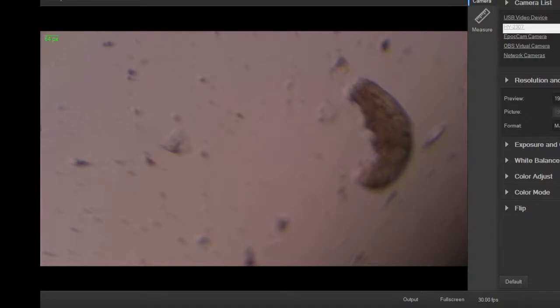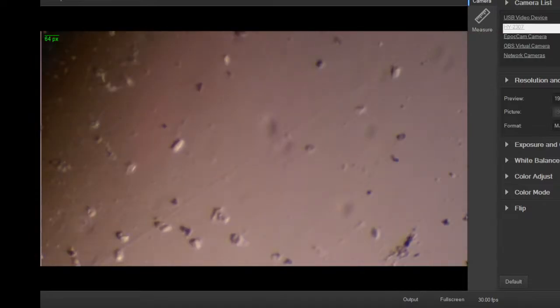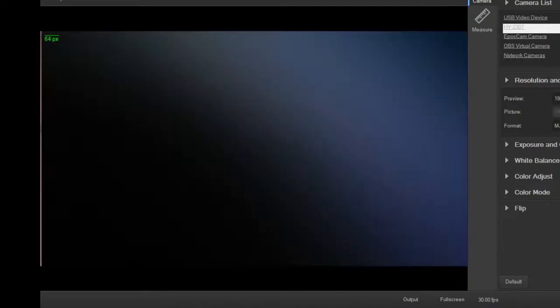Let me collect him. Put him on a proper slide. You've seen how he moves freely. And maybe real quick, just so you can get more natural lighting, I will transfer it to the dissecting scope so you can get a good look at it. Let me make sure I can find it. Okay, it's right part of the dish. If I move this carefully, I shouldn't lose it. Get a quick view of it in the dissecting scope. You see it's translucent, but looks different than it did under this other scope.